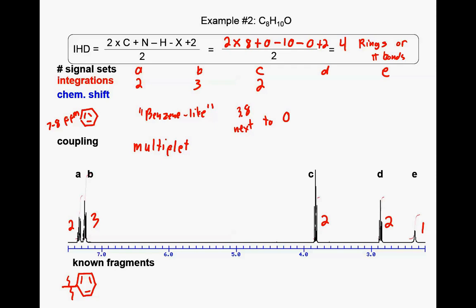Yep. How do we know what a chemical shift is? What was that? How do we know what the chemical shift is? So that 3.8, I'm just estimating, off of the x-axis. Typically, anytime you've got a peak around 4, it's most likely going to be something next to an oxygen. Yeah, but again, it's kind of like the pKa tables. We don't know specifically what the shift will be because each molecule has its own chemical shift, but what we look for is patterns. And so in this case, our pattern is we see it's around 4, so it's most likely next to an oxygen.